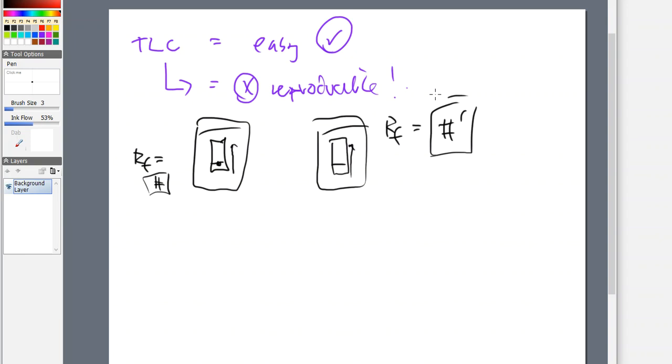We had an issue with that very early on with TLC, and we still honestly have issues with it if we do TLC in a manual way. That manual version of TLC, we still have this problem. Now, we can control it a little bit better by using some tips and tricks, but this is not really ideal at all.